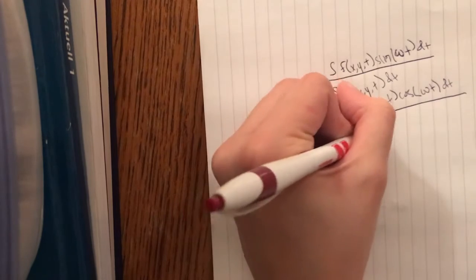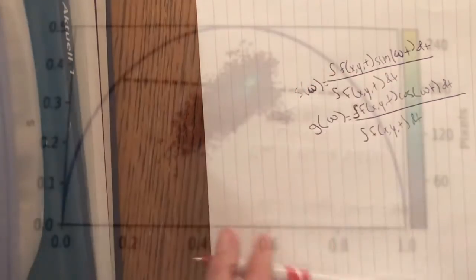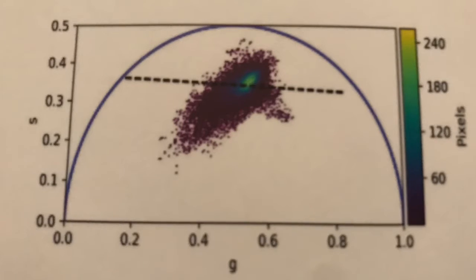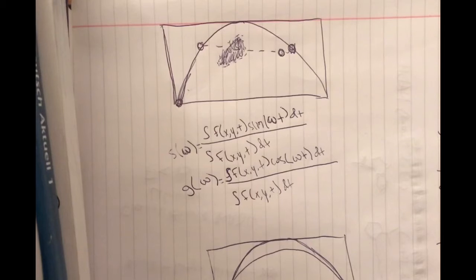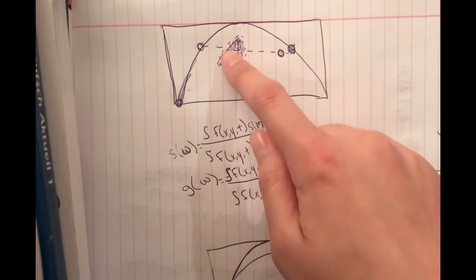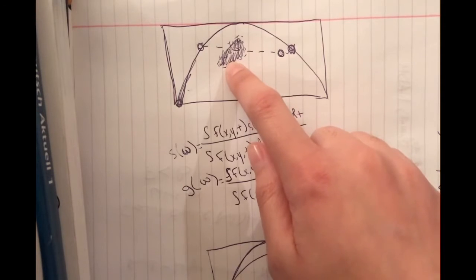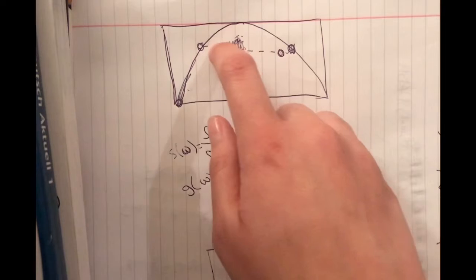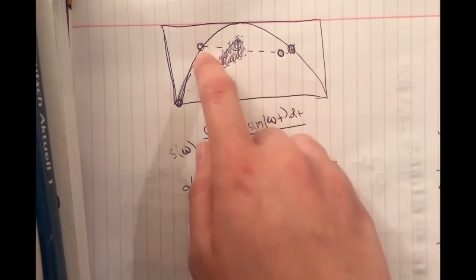Information from each pixel is put into a sine and cosine transform, which produces a phasor plot. This essentially functions as a lifetime graph while also covering the extended to folded ratio discussed earlier. I drew up a small model of a phasor plot so I can efficiently show you its use and how to read it. Each individual pixel on this makeshift phasor plot results from data from a pixel of the actual image. This dashed line is where NADH should fall given its components.